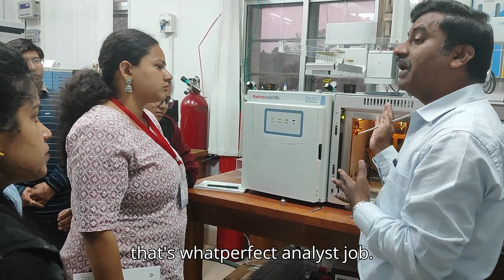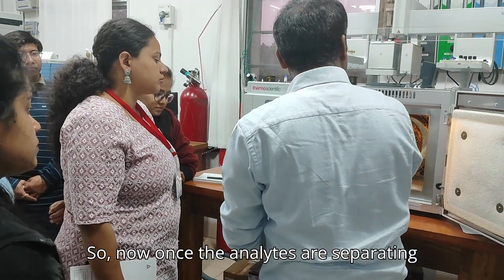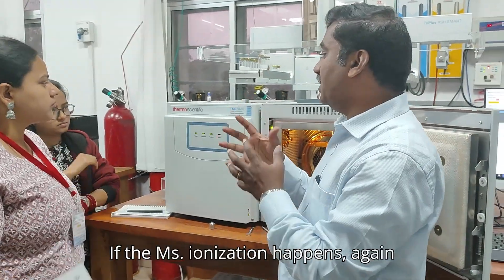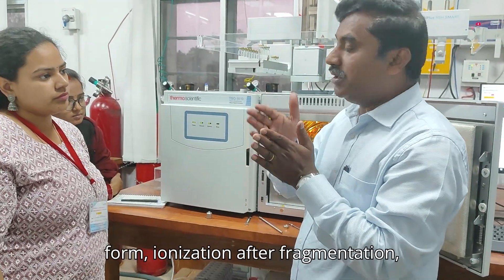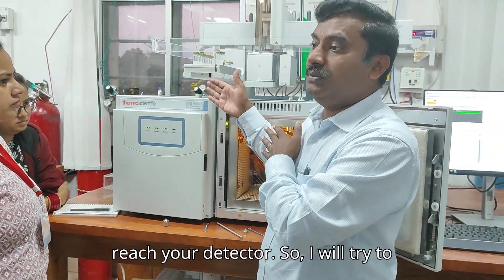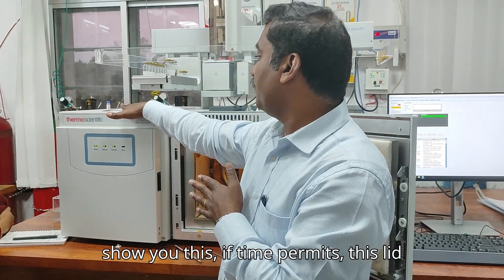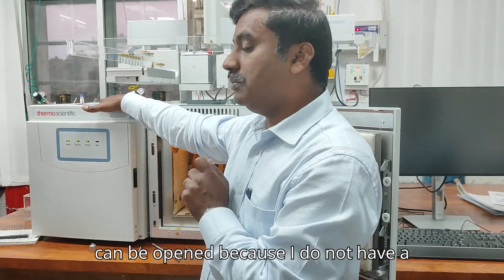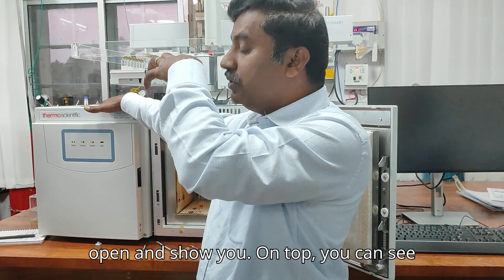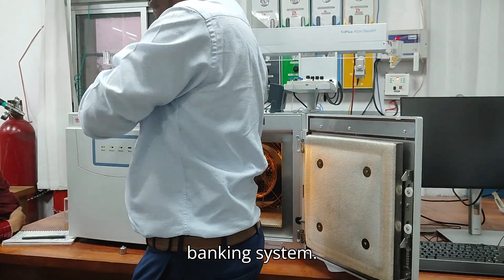Once the compound is separated over your column and goes into the MS, ionization happens — as we discussed in the theoretical part: ionization, fragmentation, then mass filtration in the quadrupole, which determines the result. I'll try to open this lid tomorrow to show you how the hardware is placed in the back-end system.